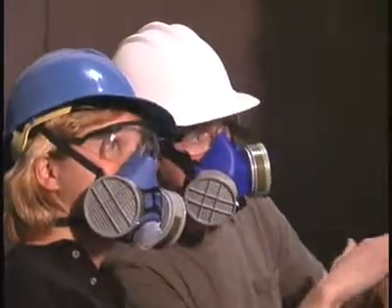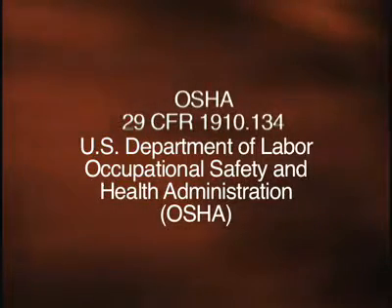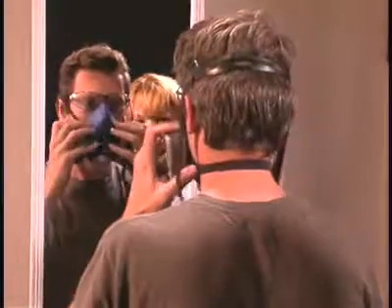of the OSHA Standard for Respiratory Protection, 29 CFR 1910.134, available from the U.S. Department of Labor, Occupational Safety and Health Administration. Read the OSHA Standard in conjunction with this video before performing fit tests. For the next few minutes, we'll discuss OSHA requirements for fit testing and the proper methods for conducting fit tests.